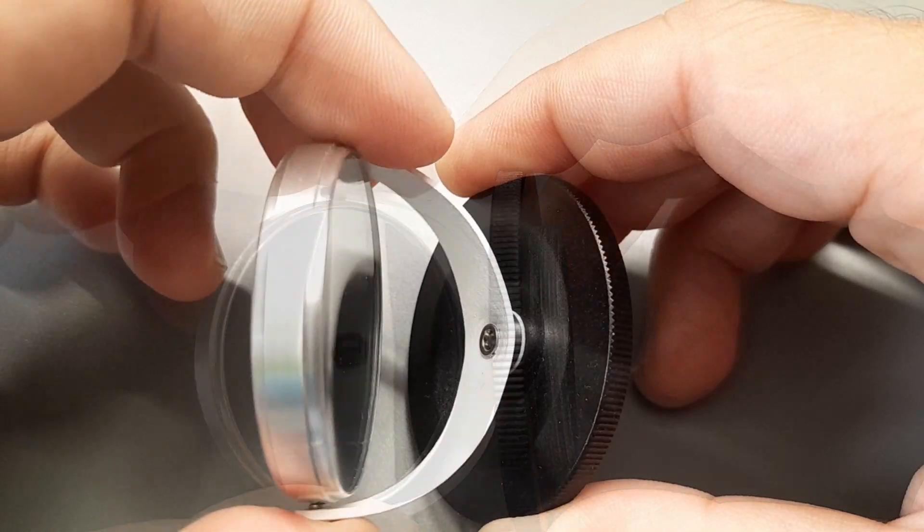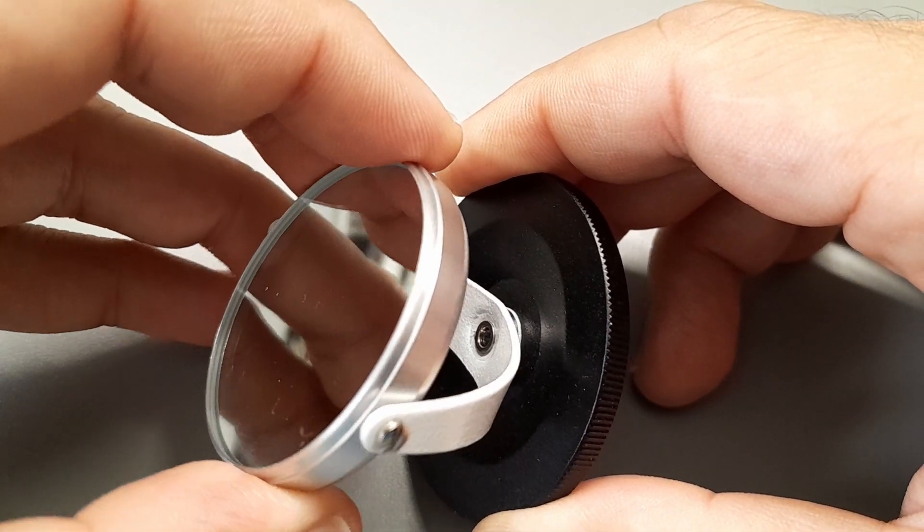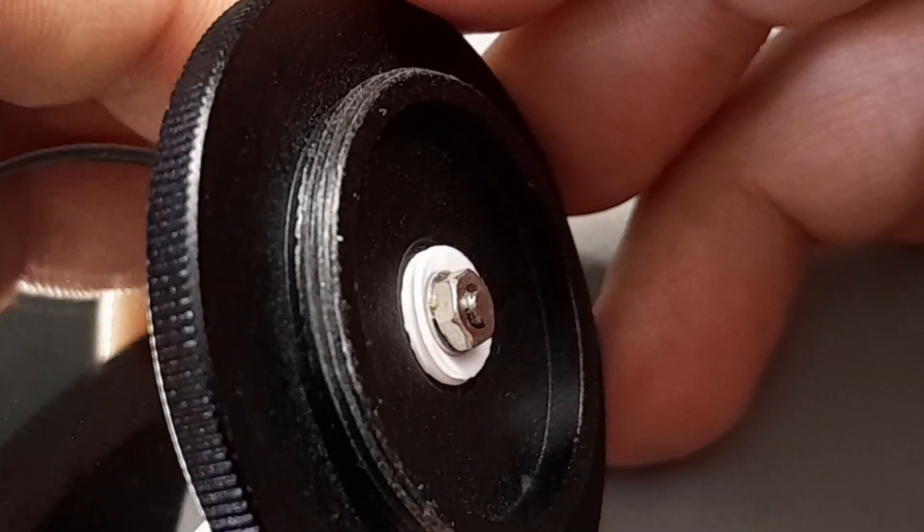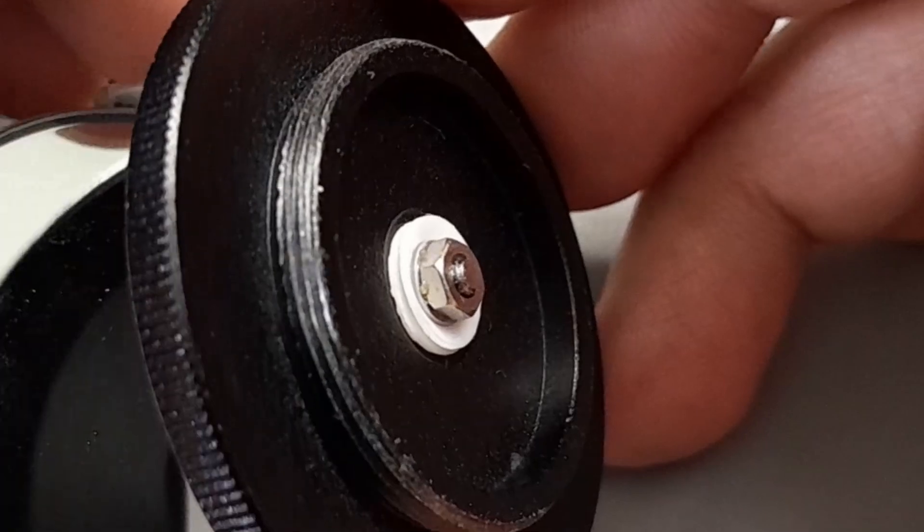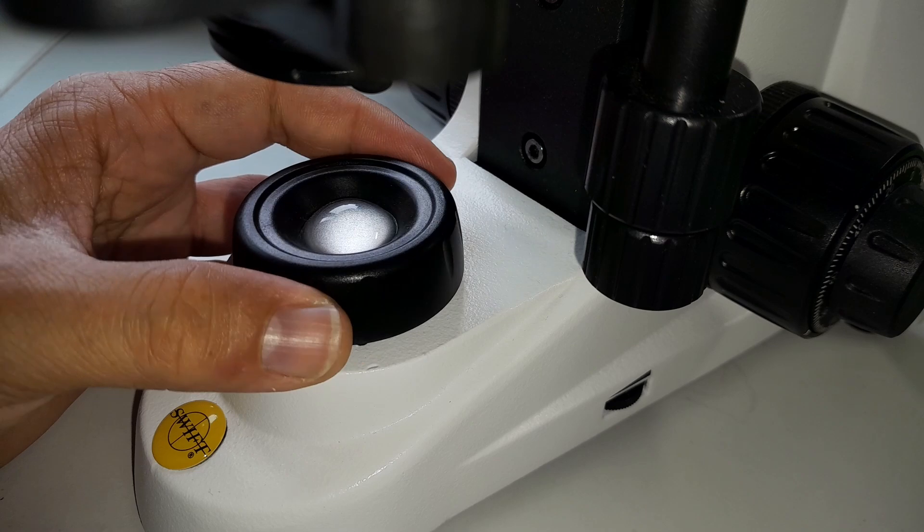The mirror can be rotated smoothly because there are also two teflon discs, and these are the white little discs here. And those discs they slide past each other. This way the nut that holds the mirror in place, this nut cannot come off due to the rotation.